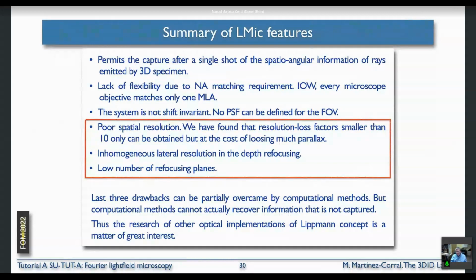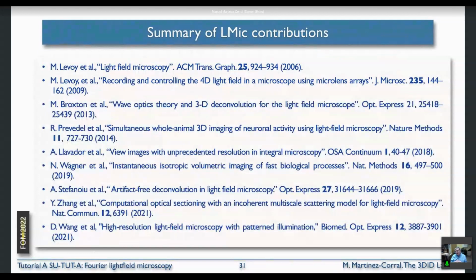So it means that, okay, the conventional light field microscopy is of great interest, but it would be nice to find another technique able to avoid these drawbacks, mainly able to avoid the problem with resolution, at least partially, or to avoid the problem that the system is not linear and shift invariant. Anyway, what I told you was a personal opinion.